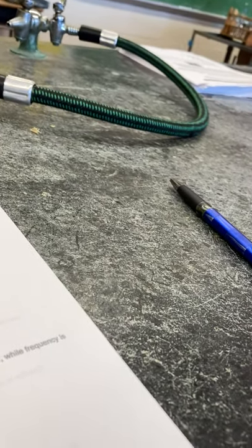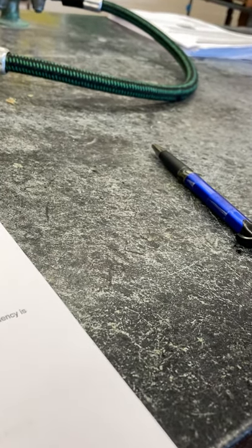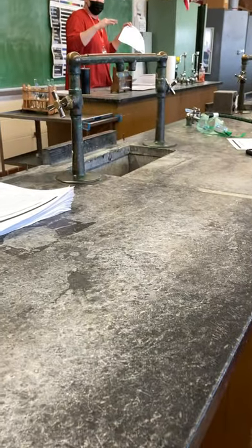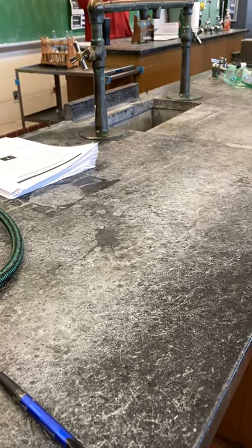Now, for example, we have LiCl on the outside here, right? So the LiCl, that's the lithium. You can see lithium at the top here. So they're asking us the flame color and the intensity. So how strong is that color? Is it weak? Is it really bright? Some of them are kind of backgroundish, and some of them are really, let's say, in your face.